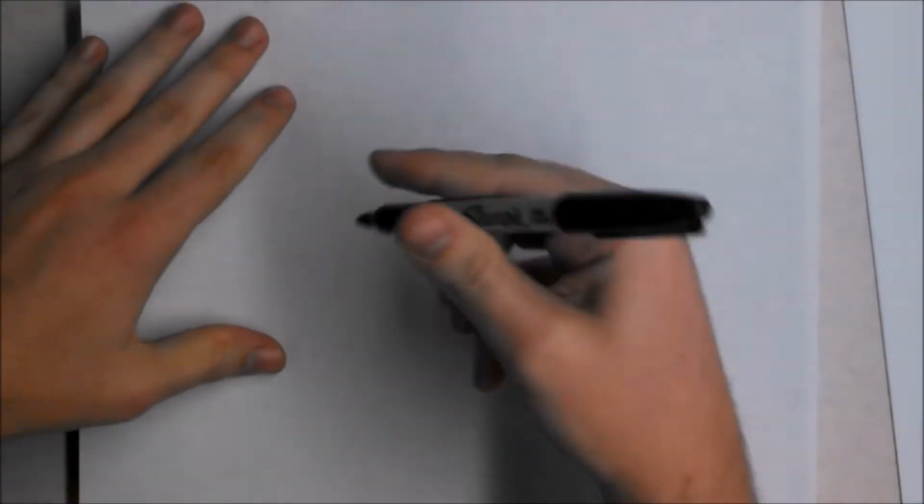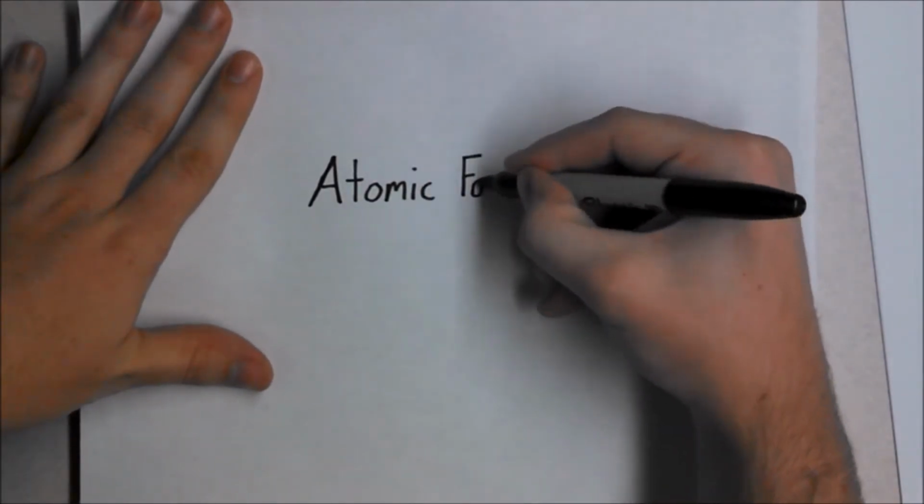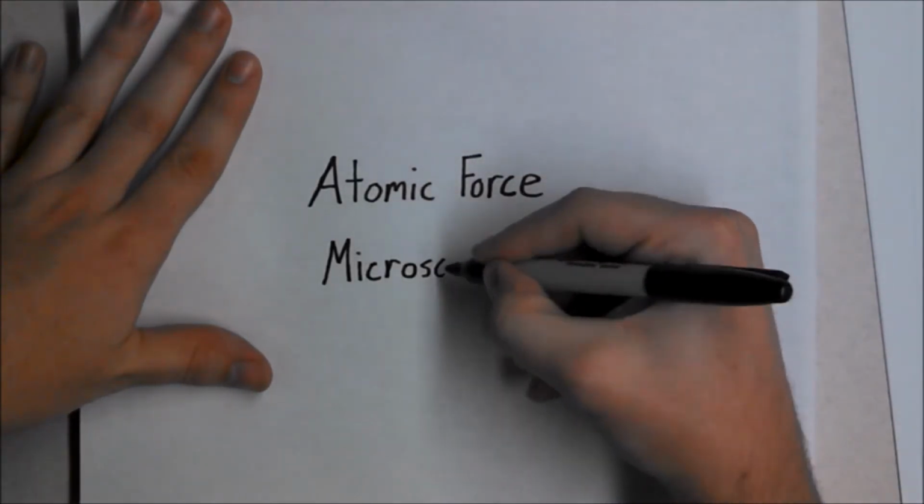Alright, hello world. I'm going to talk to you today about atomic force microscopy, which is a commonly used nanoimaging technique, and it's awesome, so listen up.